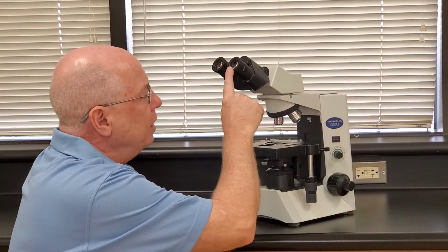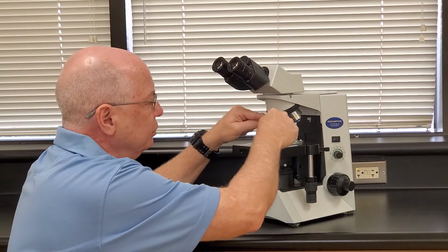When you look through the oculars, they are lined up with mirrors with this objective. It's like you're looking through a tube. If what you want to magnify or see is outside that tube, you can turn microscope knobs for days and never find what you're supposed to see.